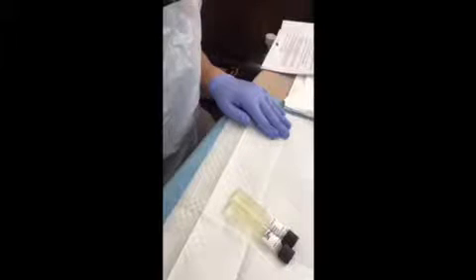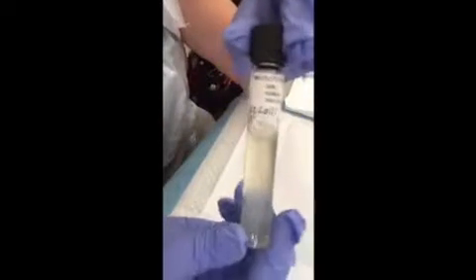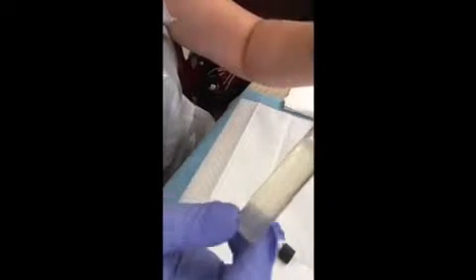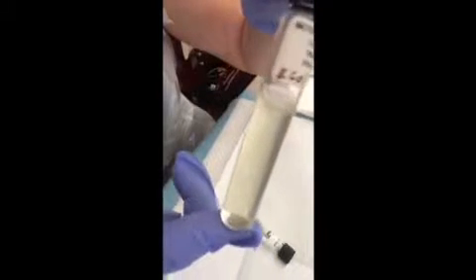So we incubated our tubes for more than 48 hours. So the first one I have is the E. coli. So taking a look at this, you can actually see where I first stabbed the agar.